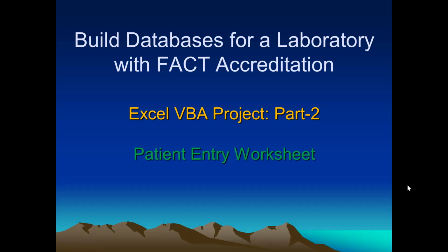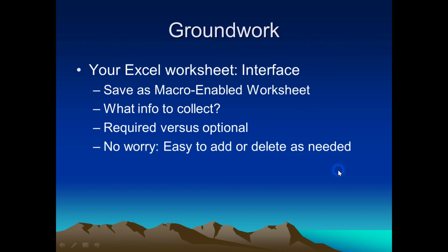As you know, in the hospital laboratory, all the work starts with the patient. So let's build the first patient entry worksheet first. The Excel worksheet will be used as the interface, and the file format has to be a macro-enabled worksheet. Next step is your decision: what information to collect, what's required, and what's optional. Although it's very easy to add or delete in the future, it's better to plan first.